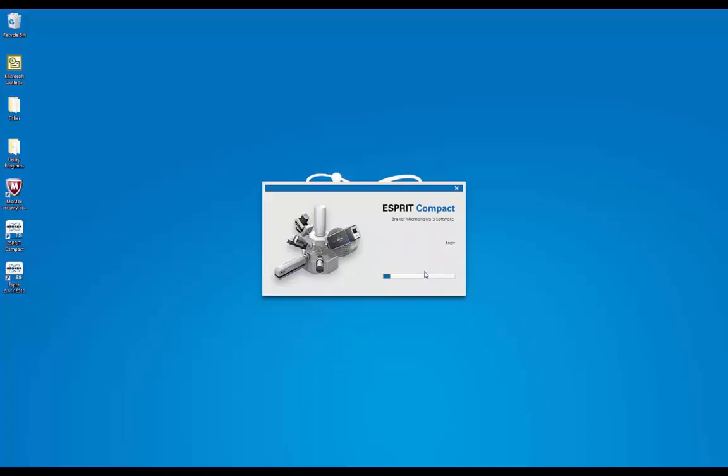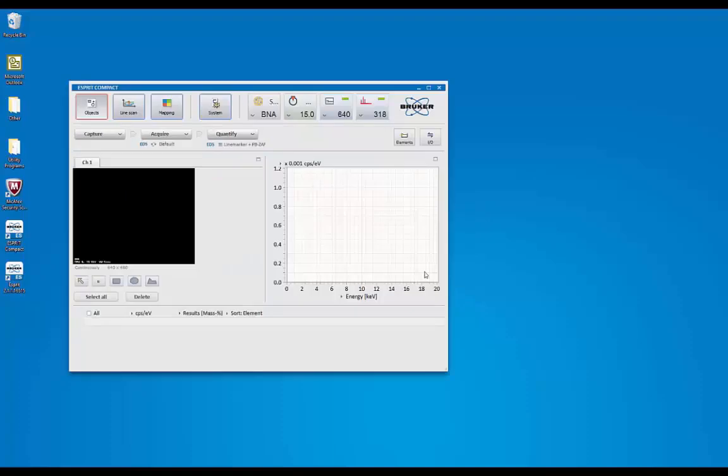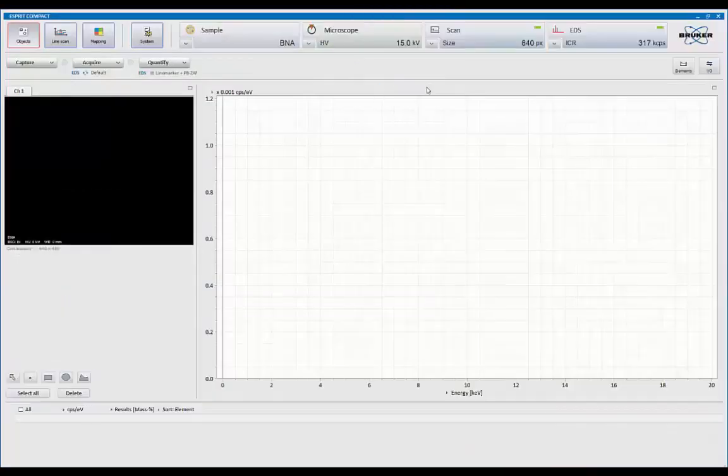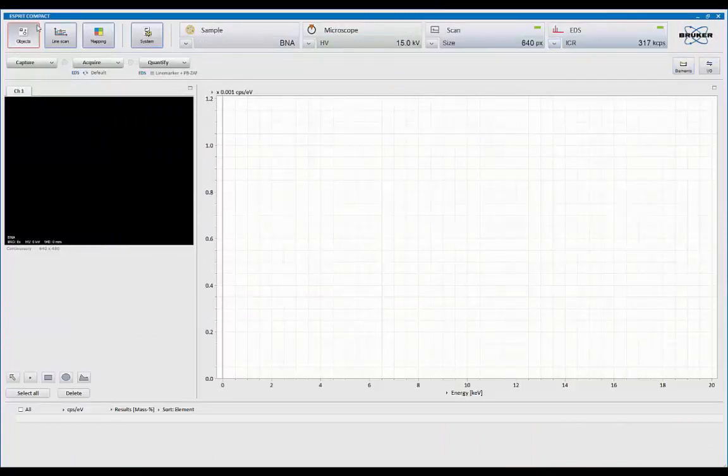Each analyst can have their own login, and you can set level of expertise, so you can have a basic, advanced, and a supervisor mode. Going full screen, this is the entire control of all the system.